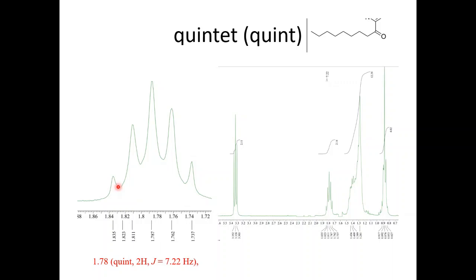The intensity follows the Pascal triangle. For J value calculation, just click on any two adjacent peaks in the software and you will get the J value displayed at the top of the spectrum. When reporting the J value, you must match it: this triplet and this triplet — if this gives 7.22, this one will also give 7.22, meaning they are coupled to each other. So this quintet signal is nicely coupled with this triplet.